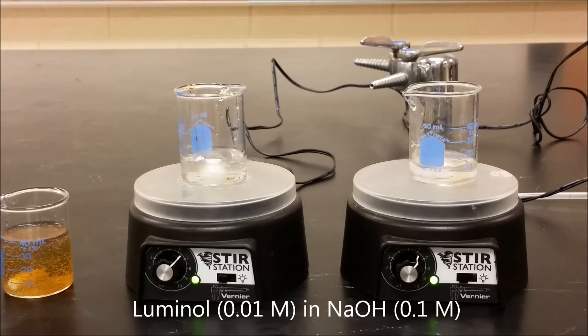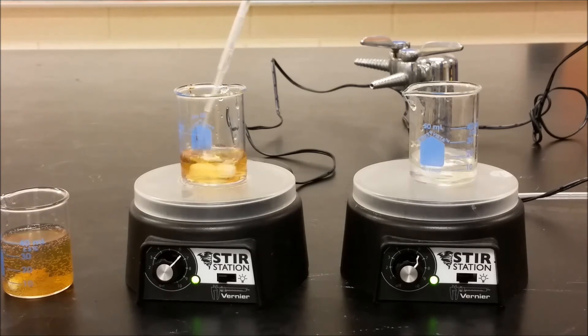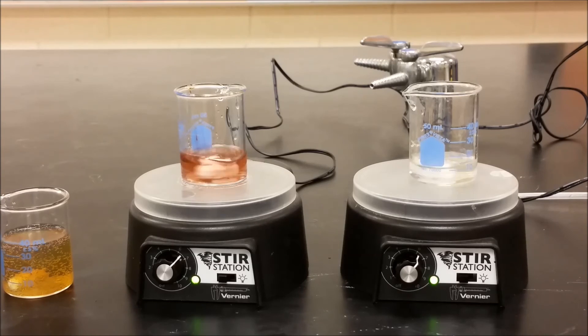Here we have our two sets of luminol mixtures, and we're going to add silver nanoparticles just to the one. I'm going to turn the lights off, and we're going to add potassium ferricyanide to both at the same time to see if we can distinguish between the luminol chemiluminescence.